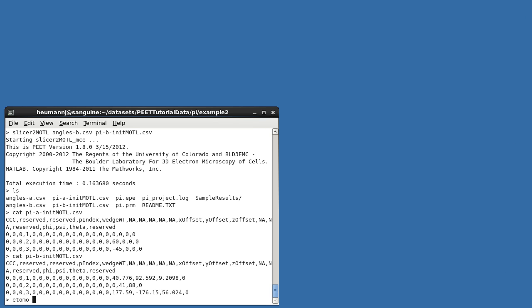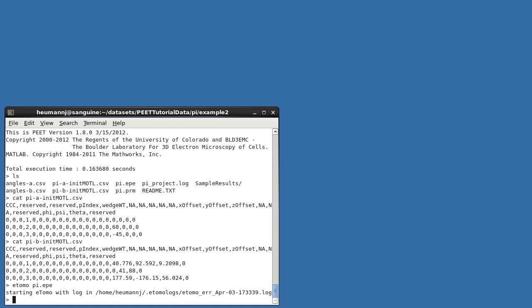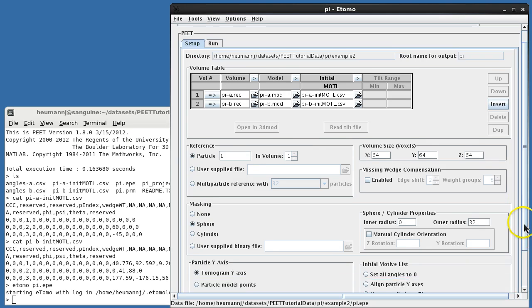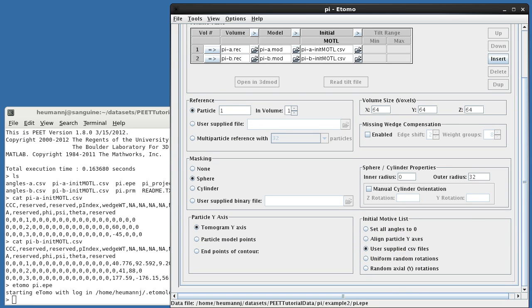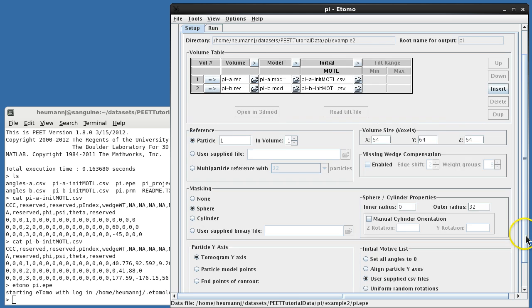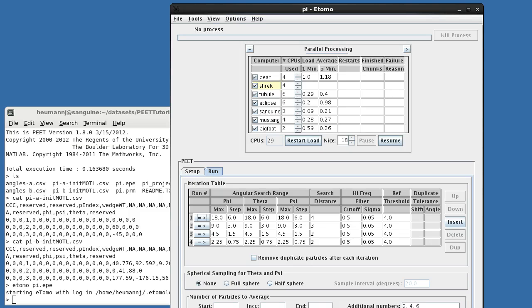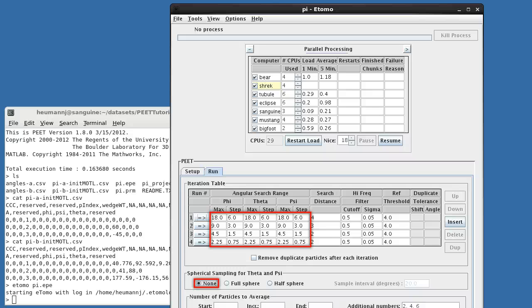Now that we have initial motive lists, we'll need different project settings to make use of them. The required changes have already been made in project PI in directory example 2. Scrolling down to the bottom of the Setup tab, you'll see that we've changed initial motive list to User Supplied Files. This enables the initial modal field in the volume table, and we've selected the newly created initial motive list for each volume. With better starting estimates for initial particle orientations, we no longer need a full spherical search, and the iteration table has been modified accordingly. We now use 4 iterations rather than 6, and the resulting alignment runs in roughly half the time, but yields virtually identical results.